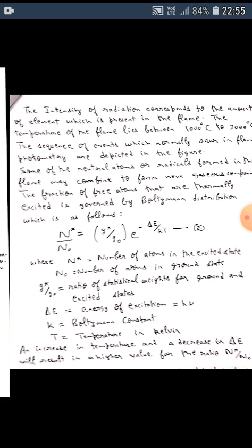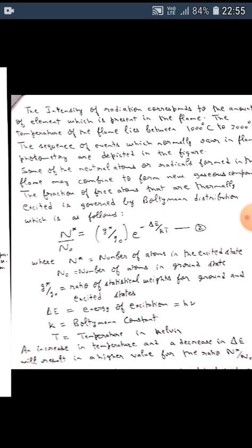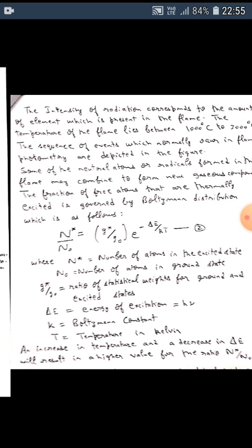Absorption spectra of most elements are simple in character as compared with emission spectra. It therefore follows that atomic absorption spectroscopy is less prone to inter-element interferences than is flame emission spectroscopy. In this respect, the wavelength of the resonance line is a critical factor.